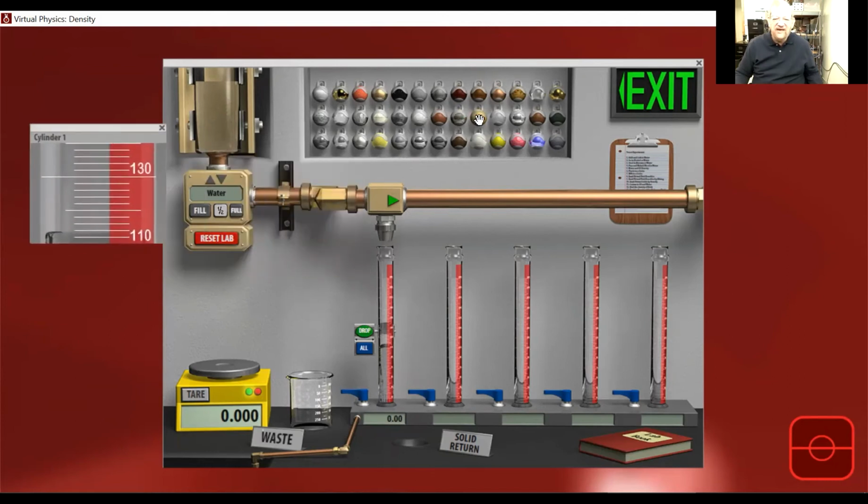If you take a sample like nickel, I can put it on the balance and weigh it and record a weight. You have to write this down. Then I'll move the filler over. I'll put it above here. Sometimes it doesn't like to. And now it's in here.